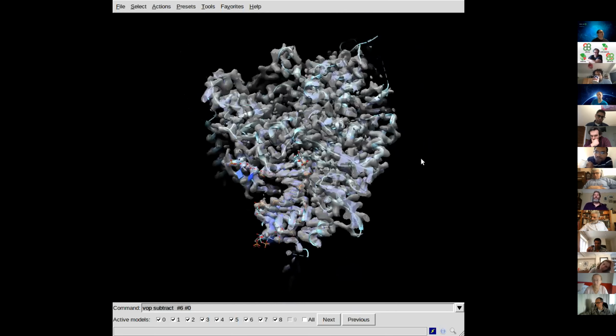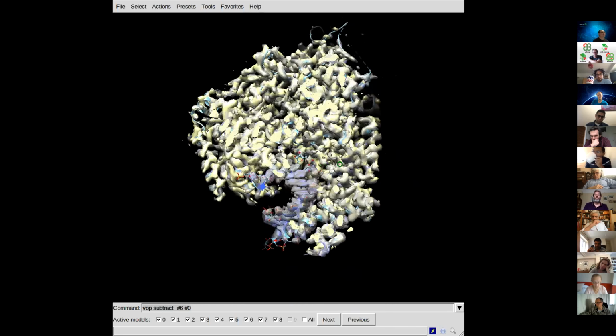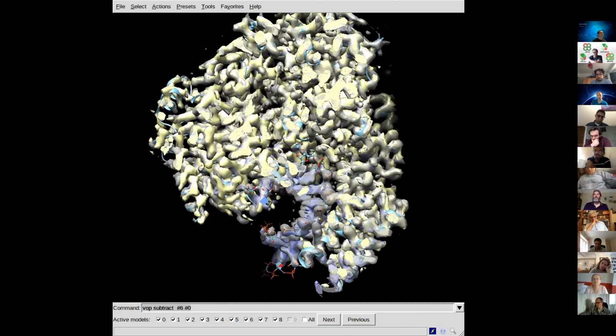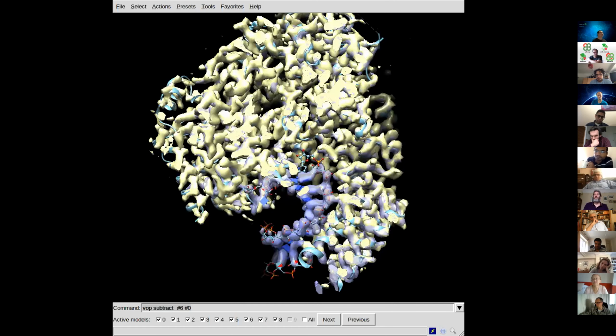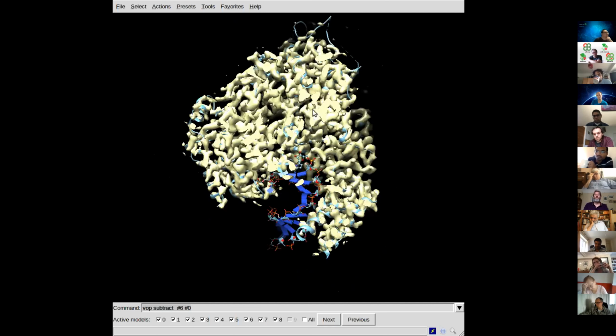And then the other thing, I did map analyses for these two using just Chimera, and you can see that one has the RNA and one doesn't. When I tried to align the other map I was investigating, I couldn't, because there was too much difference between the maps. One has a lot of extra density on it. So I did align it based on the models.